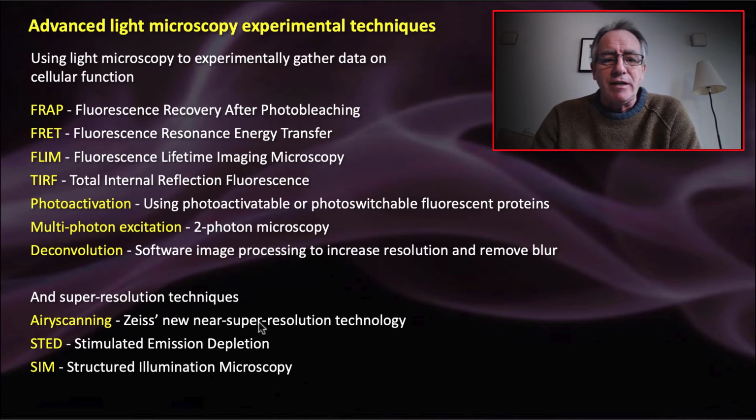And then there are super resolution techniques like Airyscan scanning. We'll call that a near super resolution technique. Stimulated emission depletion and structured illumination microscopy. So I will talk about Airyscan scanning instead later on in the lecture. And I'll mention most of these things here anyway.